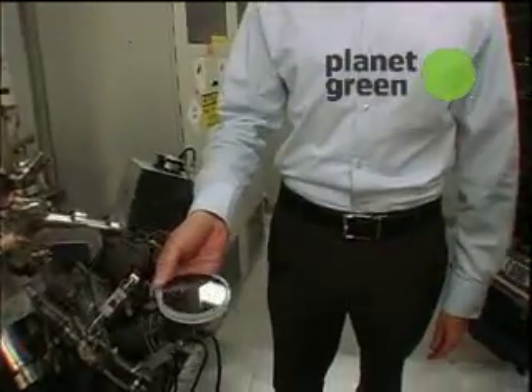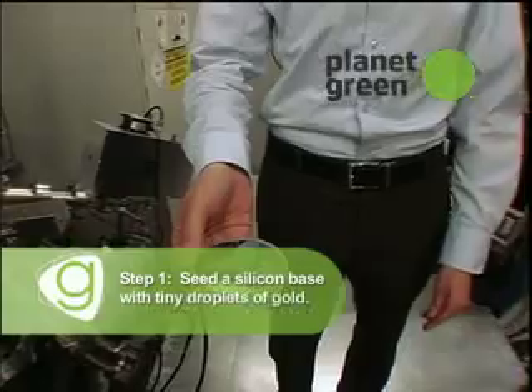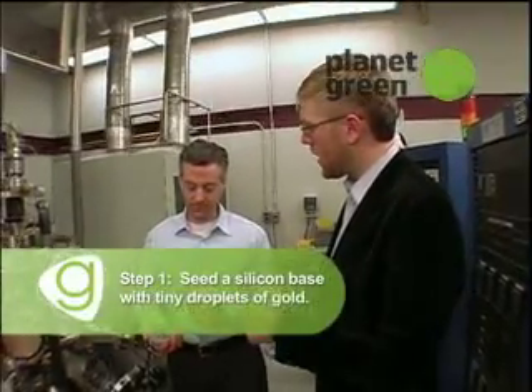How do you make a nanowire? Well, we start with a material like this — this is just silicon. We'll seed this surface with tiny gold nanoparticles. And how do you get the gold on the silicon surface? We do that in the clean room.